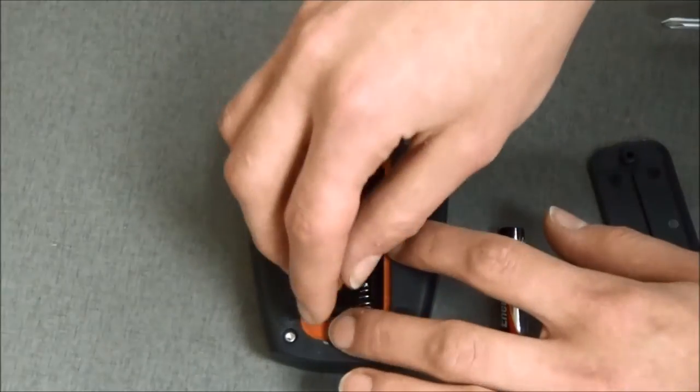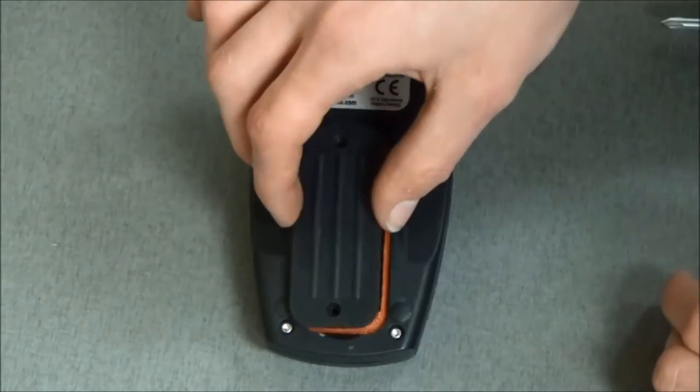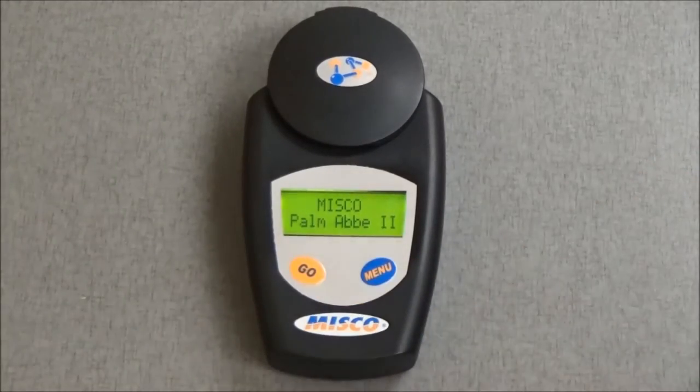Start by inserting two AAA batteries into the back of the refractometer. Then press the Go button to power on the device.